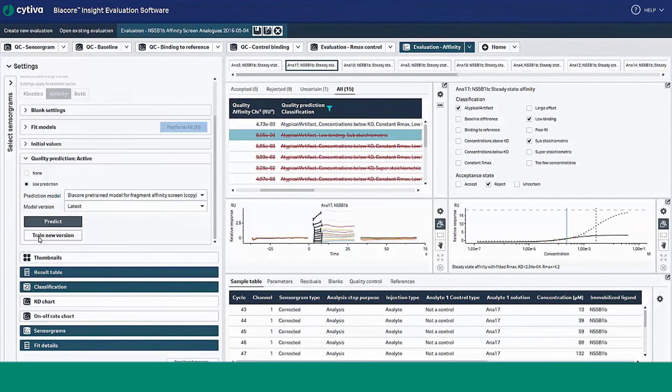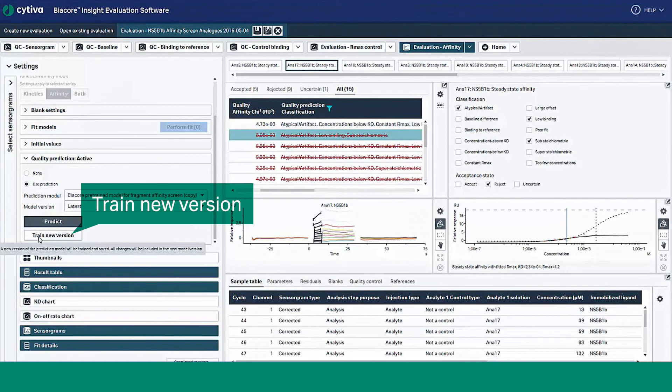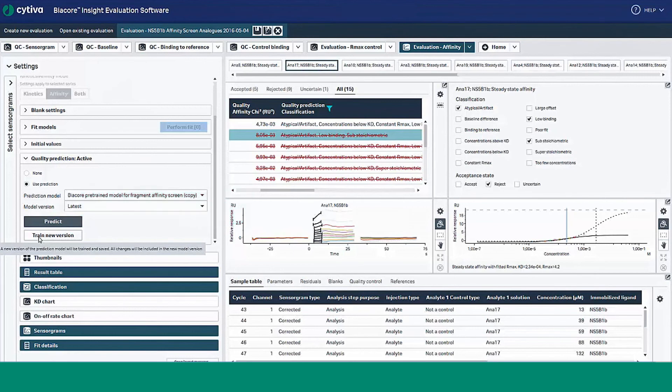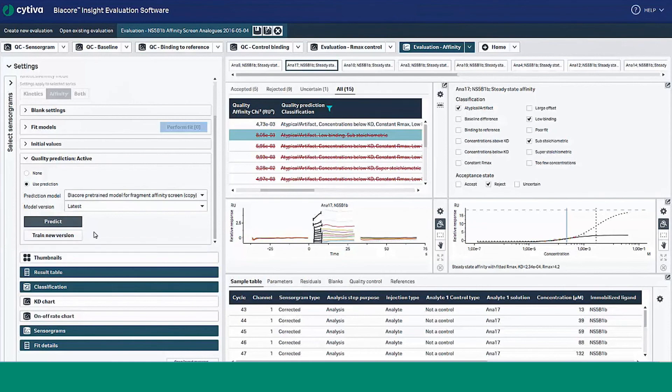you can train new versions of the model by select train new version to make changes to prediction model. The interface makes it easy to track which version of the model you're using and revert to previous versions as needed. Retraining does not overwrite the existing model.